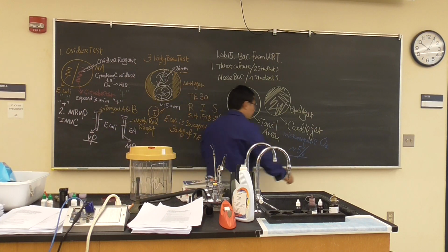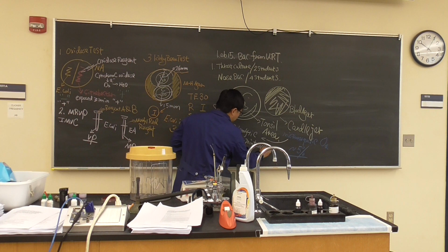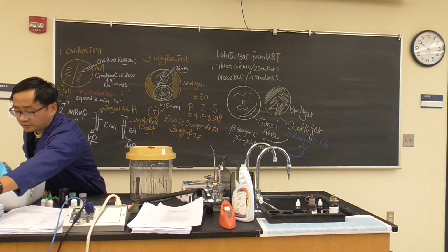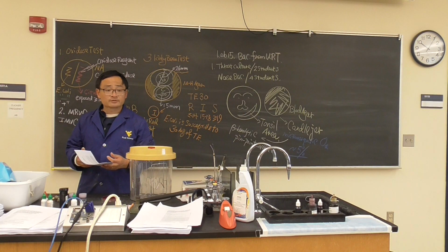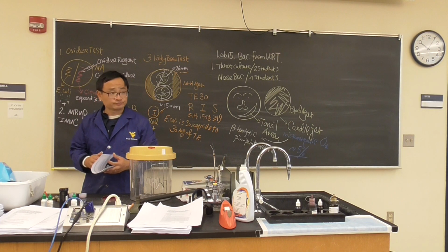This is a very good environment for beta hemolytic pinpoint colonies to show up. The fact sheet is right here. This needs 2 of you to work together, and it will be our unknown number 2. So on Thursday, I will point out to you the pinpoint colony you would pick. Then you do the Gram stain, and also we do the catalase test.